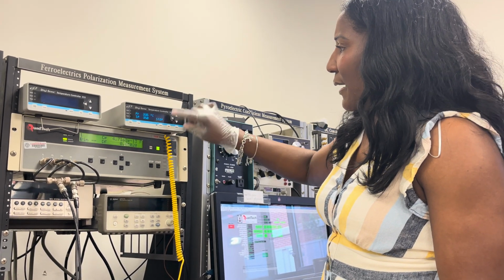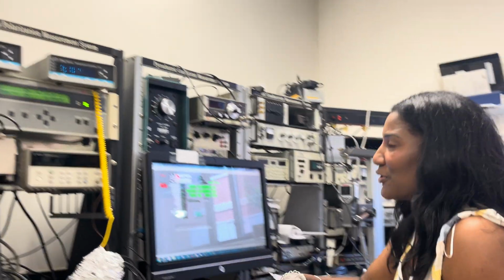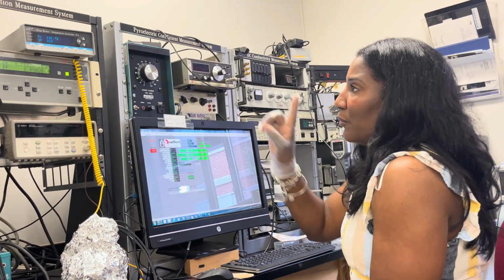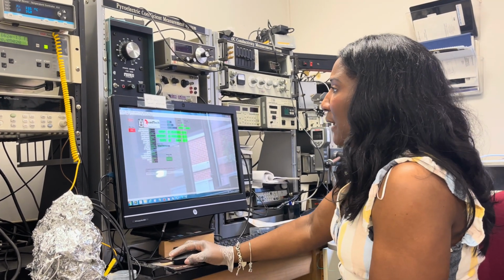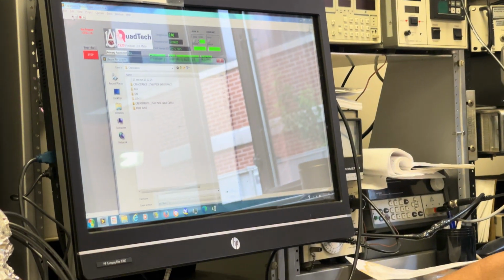And now we know that it's starting to increase the temperature in our chamber. So the key here is always you want to see that green light for the heat. You know that when you press the button that it's actually working. Now what you want to do is go ahead and hit the run button. It's just the arrow under the edit.